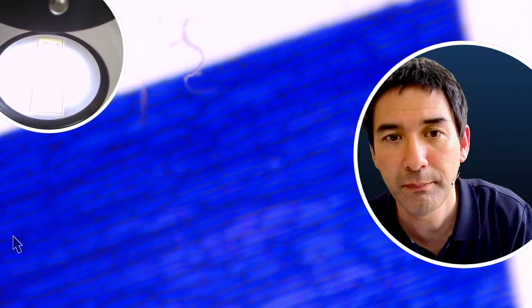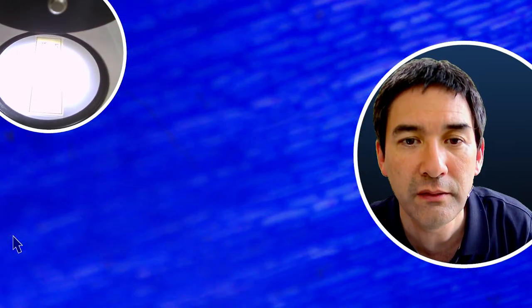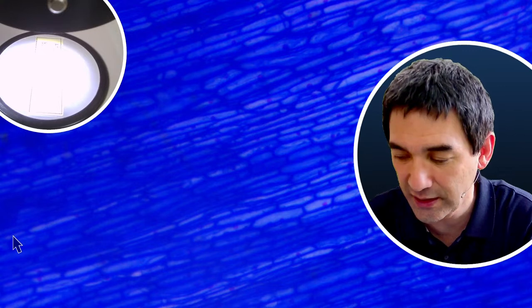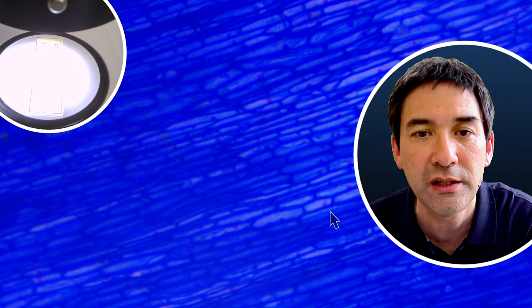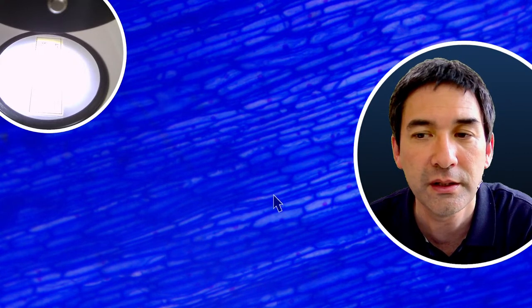This here — these are onion epidermis cells. Look at this — we're already at maximum magnification. We are able to see not only the individual onion cells but also the nuclei. The specimen is maybe stained a little bit too strongly, but the individual dots you see inside the cells are the nuclei, and they can be seen quite easily.